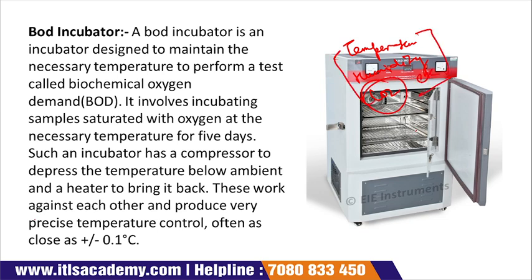Now, what is the role of the incubator? The incubator provides the environment for the growth of microorganisms. As we all know, microorganisms grow at a particular temperature, like bacteria.